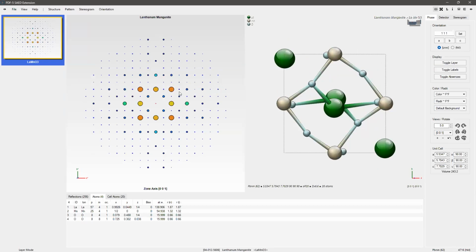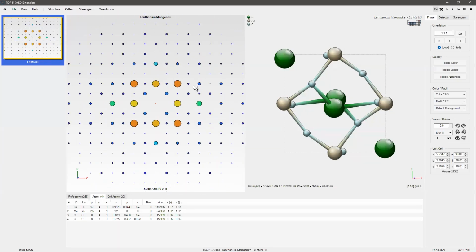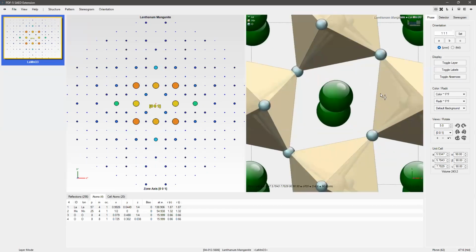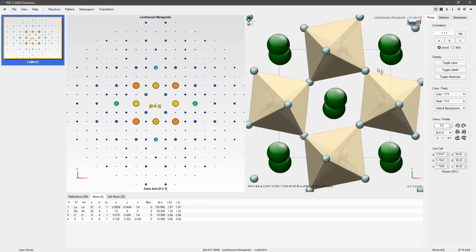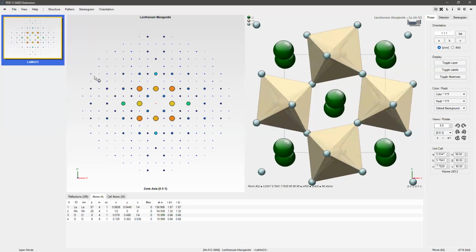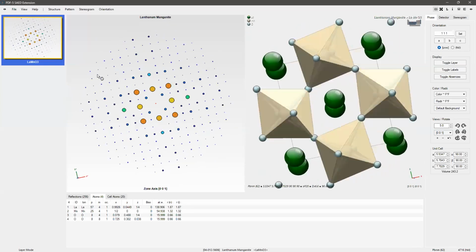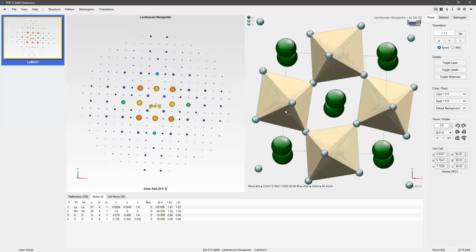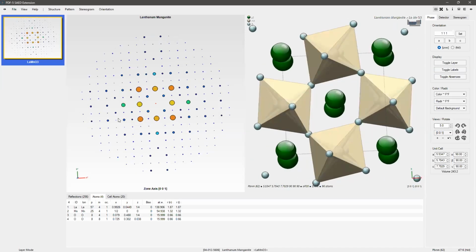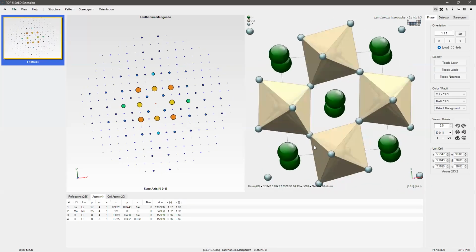So what we do in our software is whenever we right mouse button drag on the right side of either the pattern display or the structure display, we perform a zoom. The same holds true for the mouse wheel on the right side of the display. When we do a right mouse button drag on the left side of the display, we perform a rotation around the screen normal. And that is sometimes very frustrating to get done in other programs. So anyway, these are the conventions here.